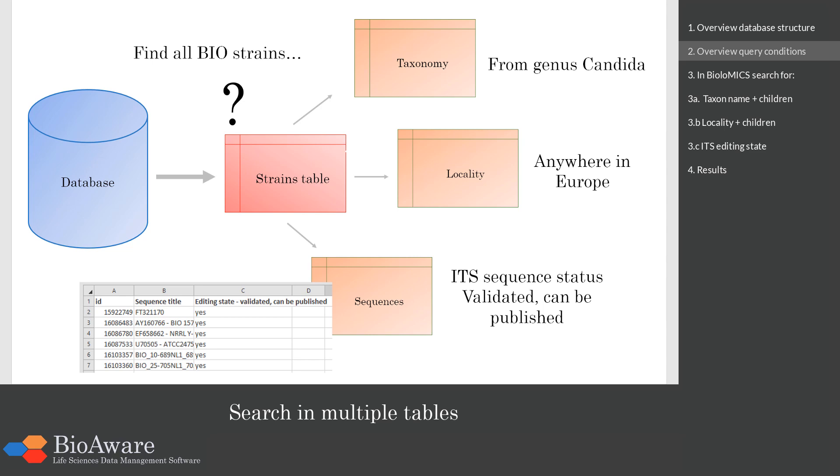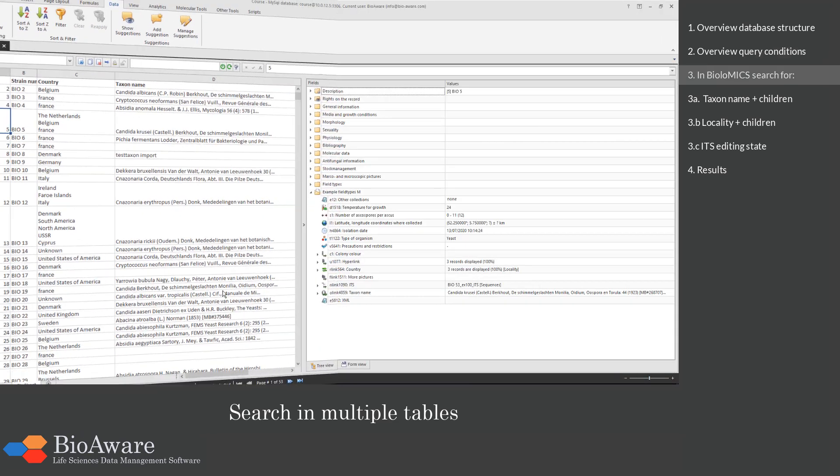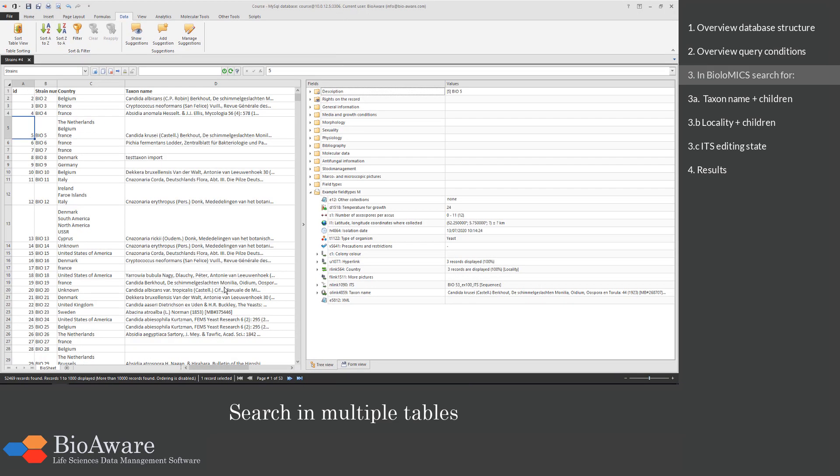And the last condition we will add to this same query is that the record should also have a positive value in the field editing state validated can be published in the ITS sequence. So when we know what we search for we go to Biolomics.